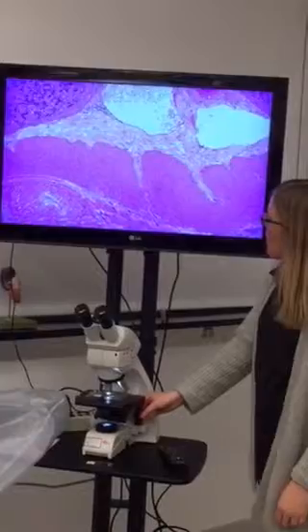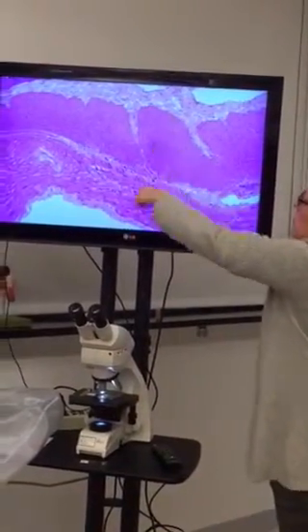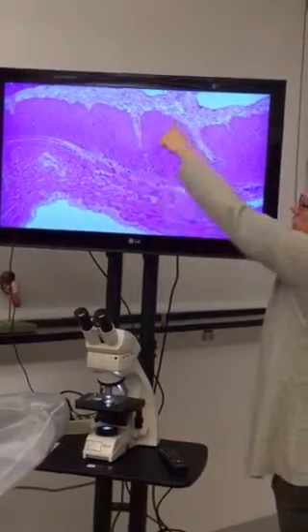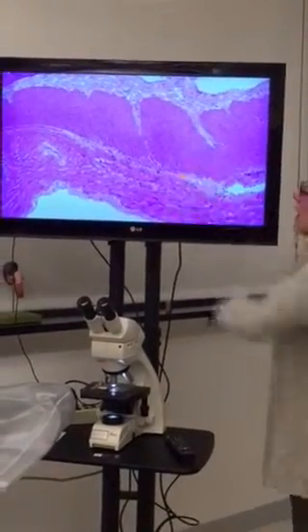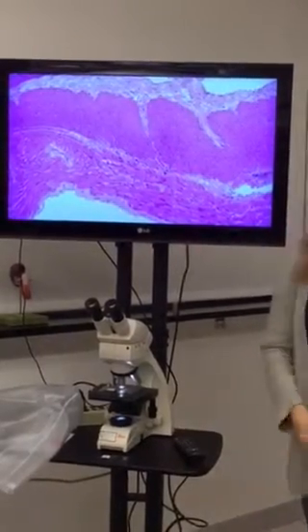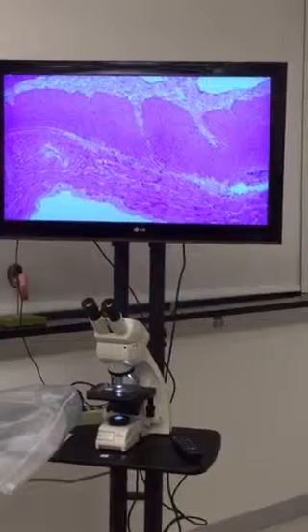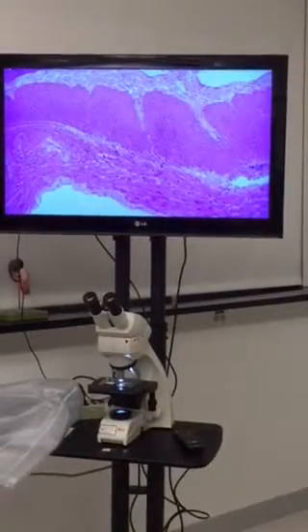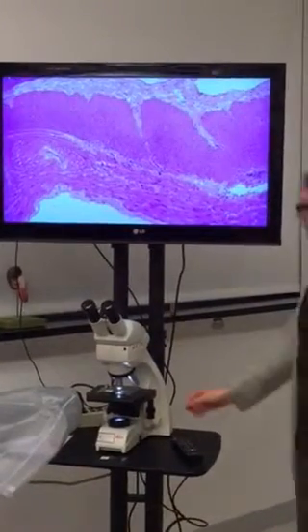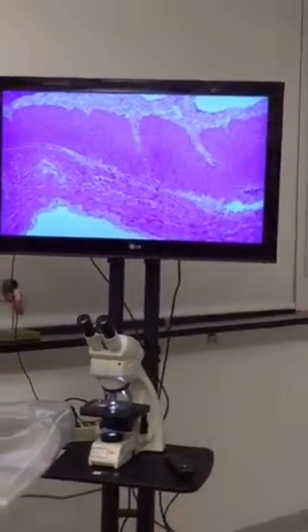Now after the submucosa, you can see large bands of muscle in here. You don't have to know all the bands, but there are 3 layers. All of this is smooth muscle. All of that is the muscularis externa. And then the outermost is serosa, which is basically visceral peritoneum, the serous membrane attached to the stomach. So the big muscle layer is very similar to the esophagus, but it's thicker because the stomach churns the food more.